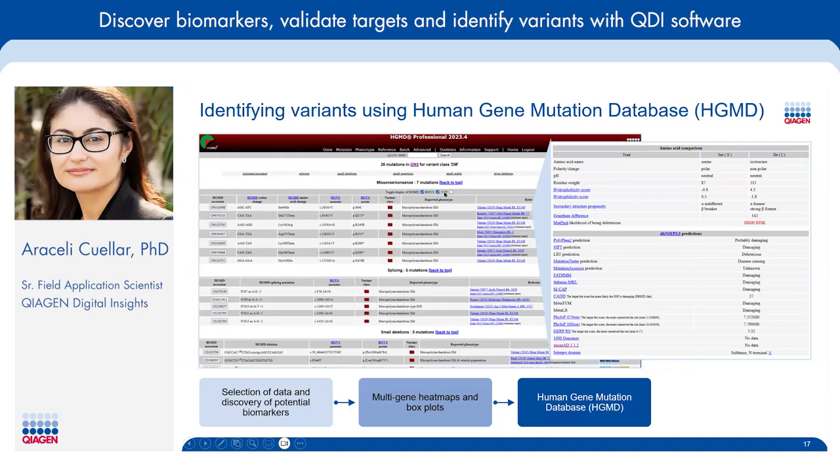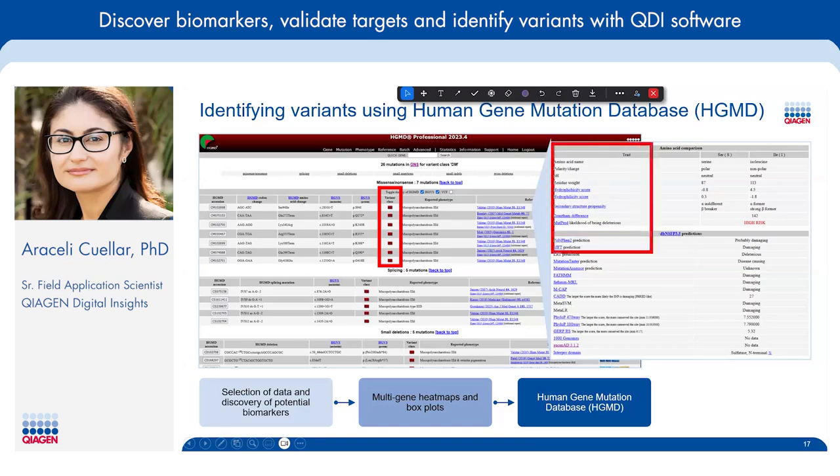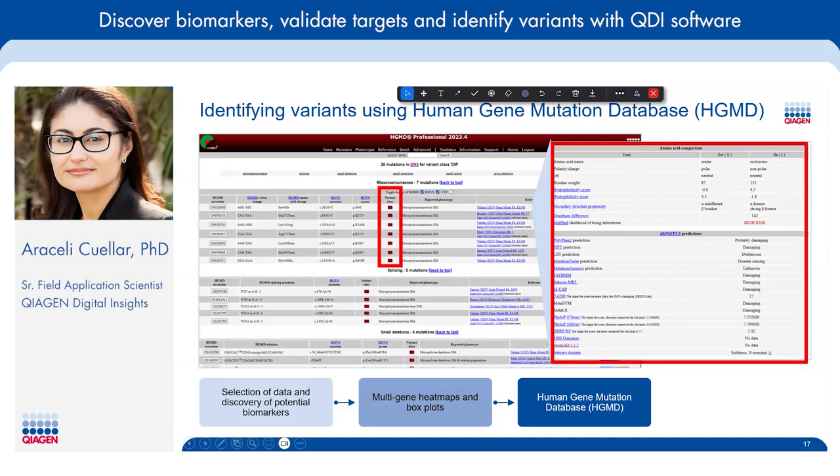And so with the Human Gene Mutation Database, or HGMD, you can take a look for different variants that may be identified in a disease, that might be identified through publications, and see how those particular variants are tied to a particular disease state or phenotype, get information on whether those variants are classified as disease-causing variants, and then dive deeply into the biomedical properties of these variants to see how deleterious they are, or whether these mutations have a gain or a loss of function.